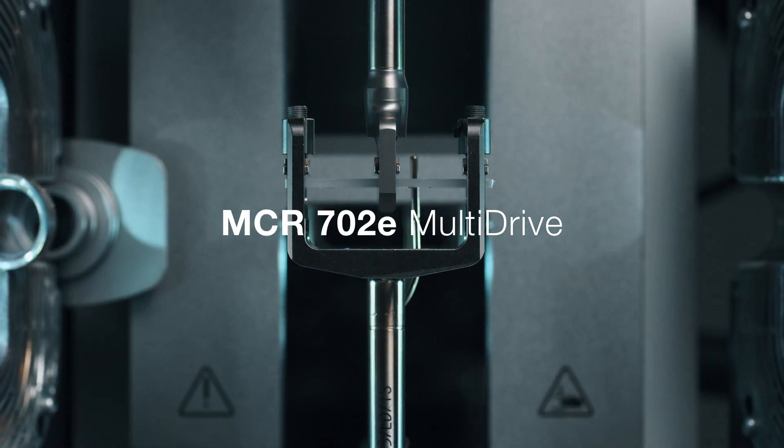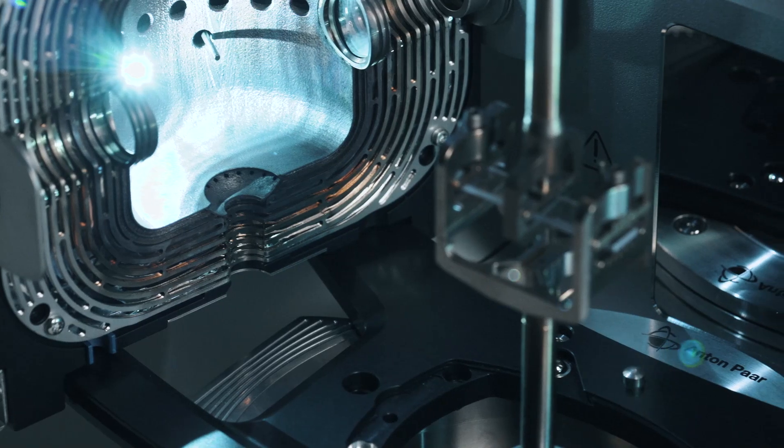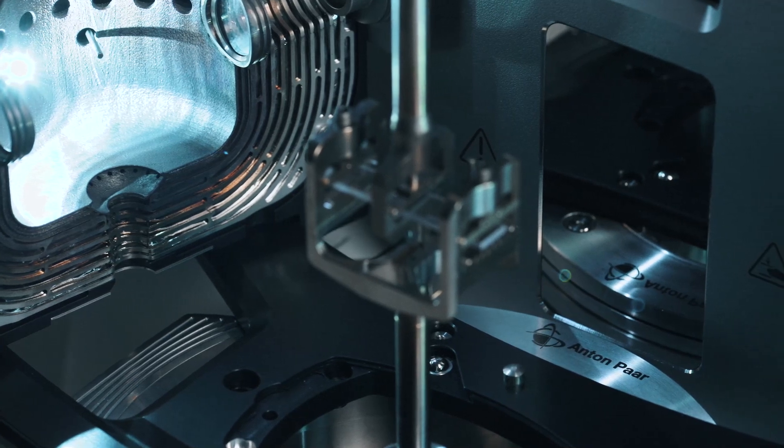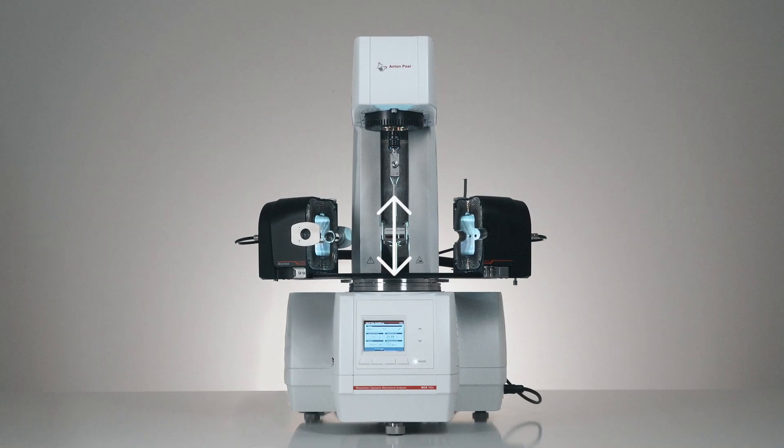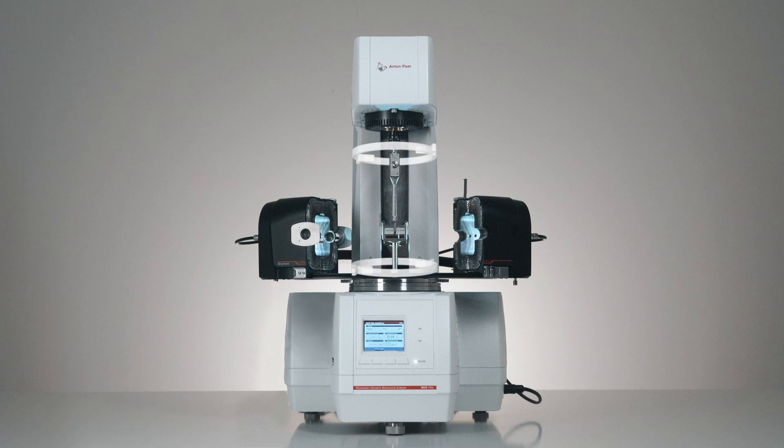MCR 702 Evolution Multi Drive boasts the same advancements as the 302, plus the power of two drive units for the most sophisticated rheological research.